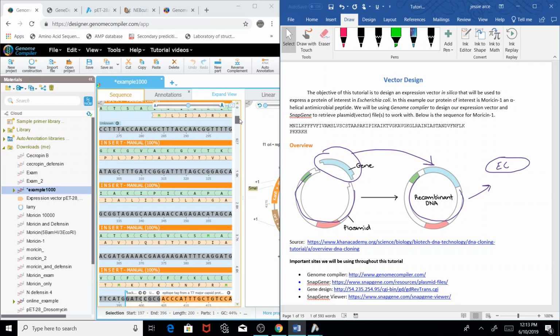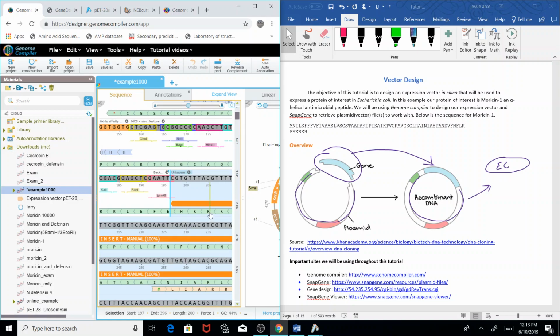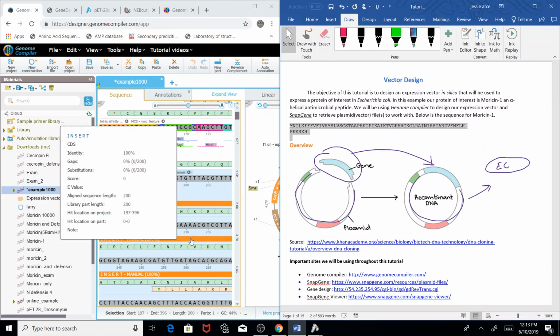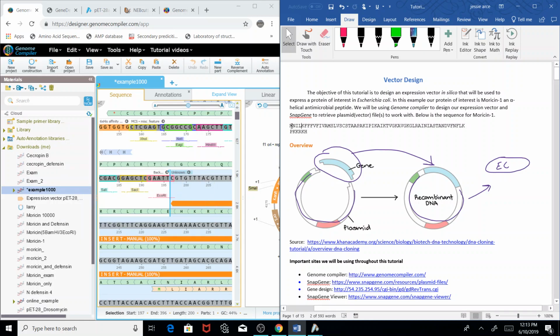And then the last bit we had right here is our ending sequence. Arginine, lysine, and histidine. So it's safe to say that we have our gene of interest. Our gene of interest is in the correct reading frame, because when we look through the reading frames, the second reading frame indicates that we will get this protein. This protein is a resulting product.